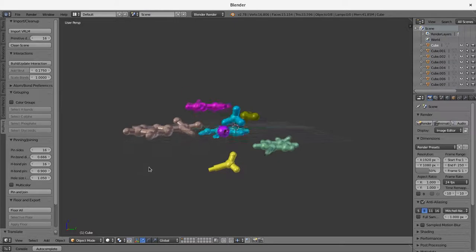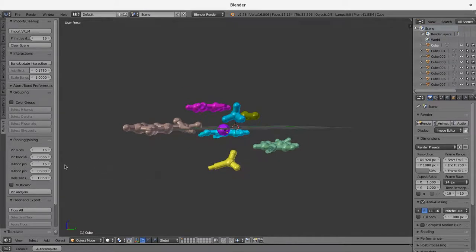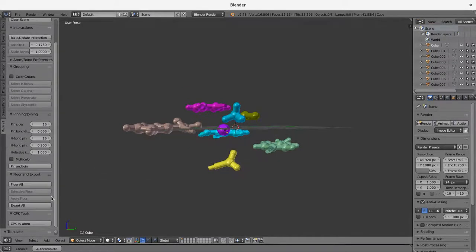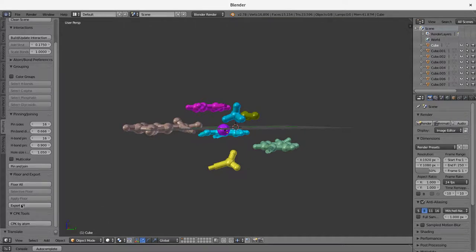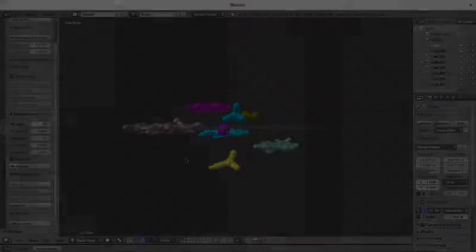The only thing left to do at this point is to export these models. And we can just click export all. And then each of these will be generated as an STL file that will be ready for printing.